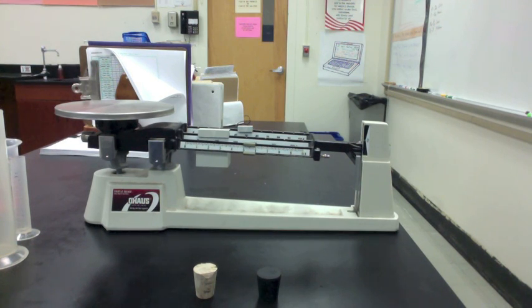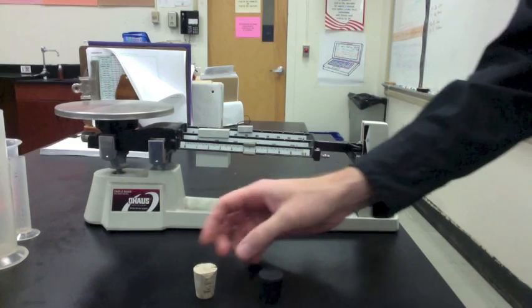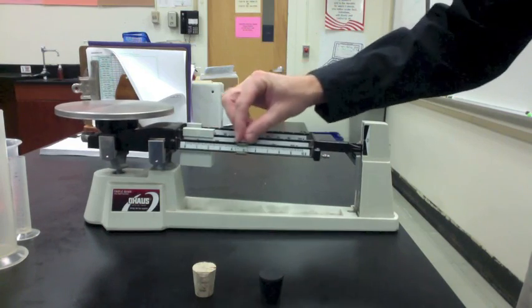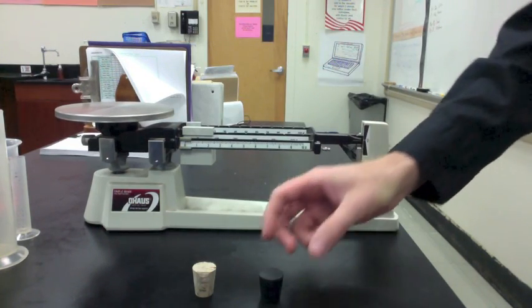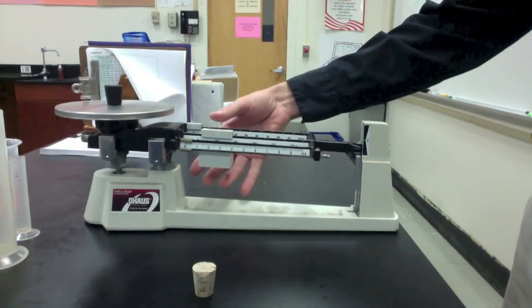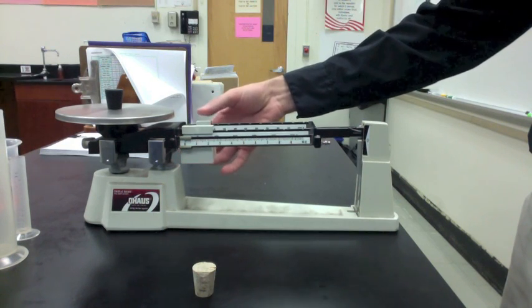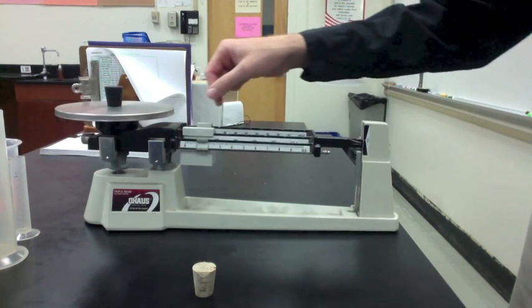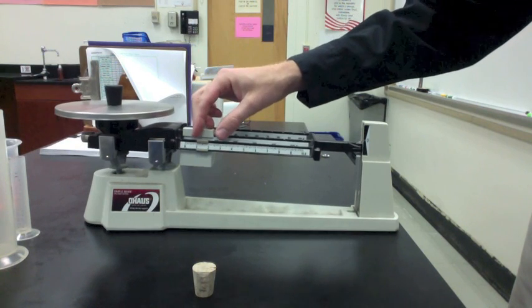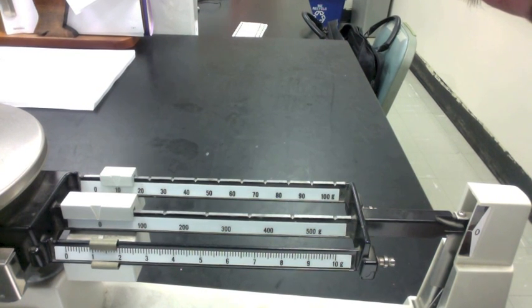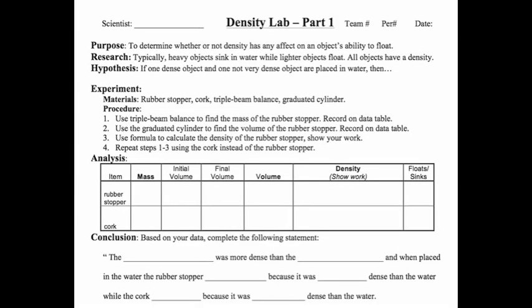Let's use the triple beam balance to find the mass of the rubber stopper and the cork. First step is to zero out the scale. Place the rubber stopper on the pan and find the mass, moving the biggest rider first, then the medium rider, and finally the smallest rider. With the scale balanced, add up all the readings on the riders. Put that mass on your data table under the column for mass.